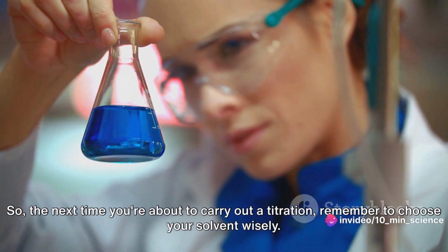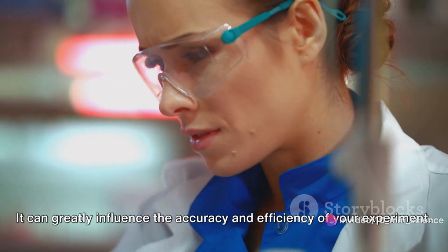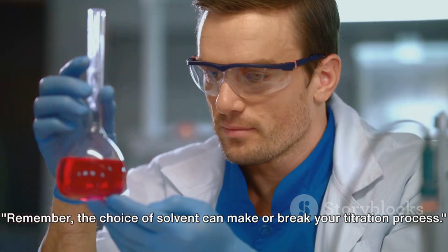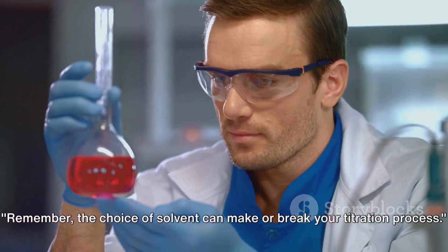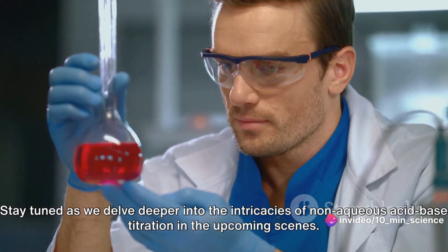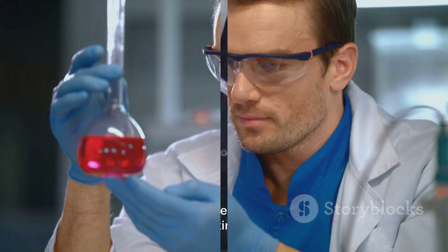So, the next time you're about to carry out a titration, remember to choose your solvent wisely. It can greatly influence the accuracy and efficiency of your experiment. Remember, the choice of solvent can make or break your titration process. Stay tuned as we delve deeper into the intricacies of non-aqueous acid-base titration in the upcoming scenes.